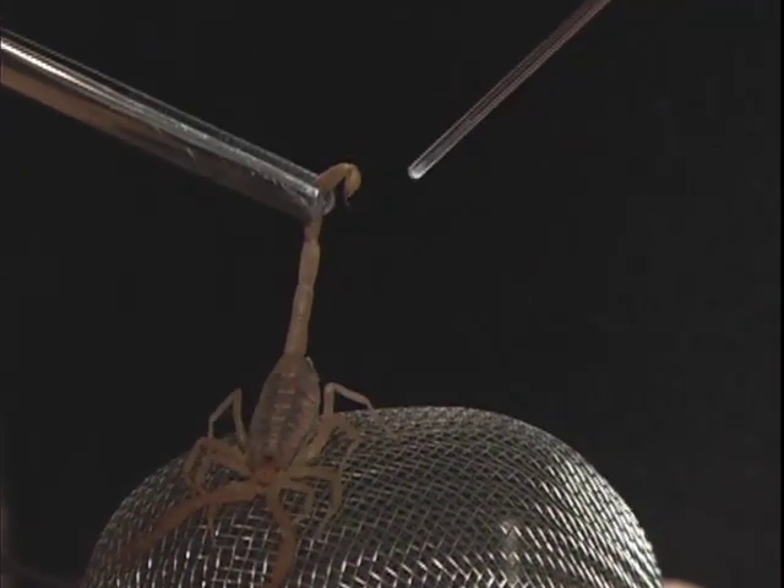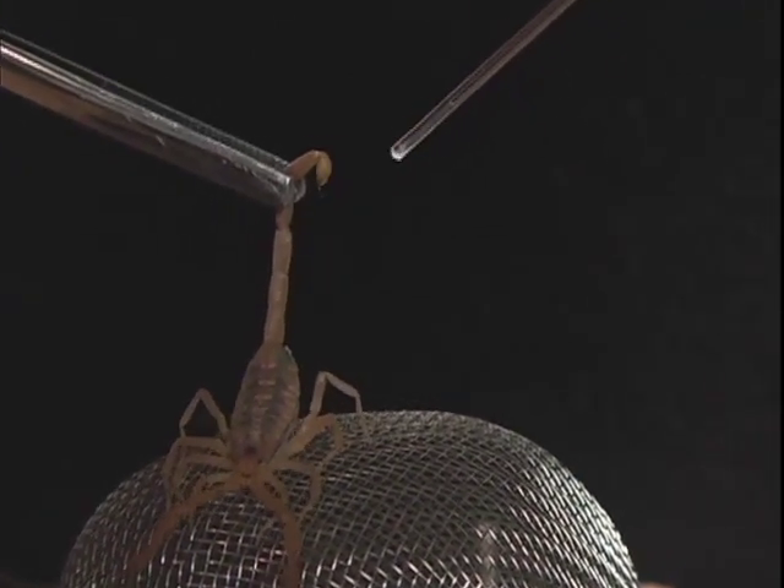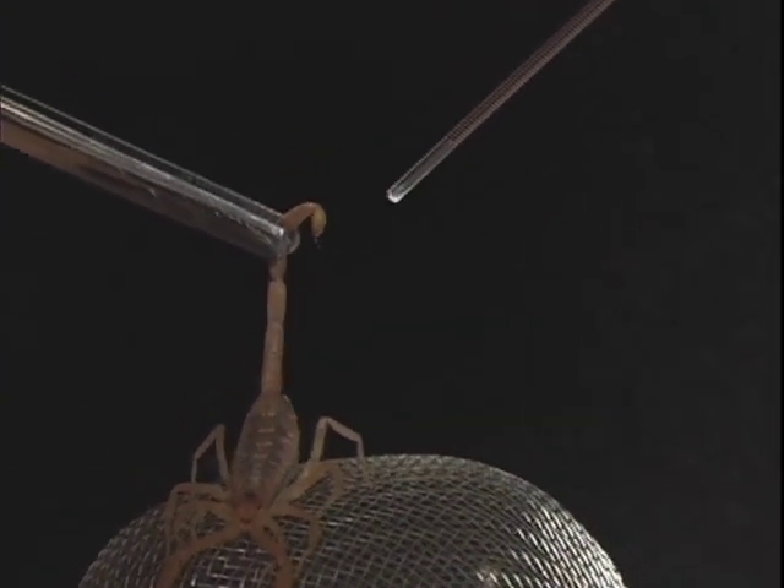Here's another view of a scorpion being milked. See how the tail pulses with the stimulation, how only a tiny drop of venom comes out, and how I capture the venom with a capillary tube.